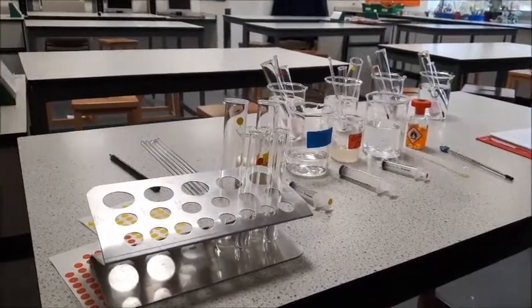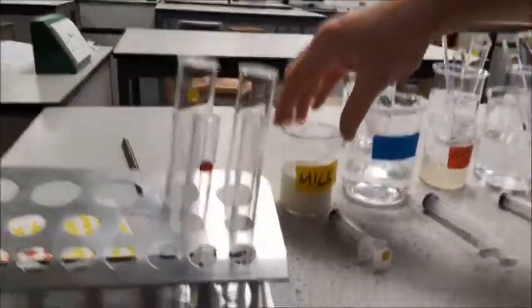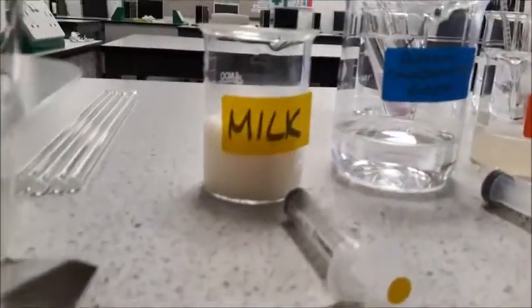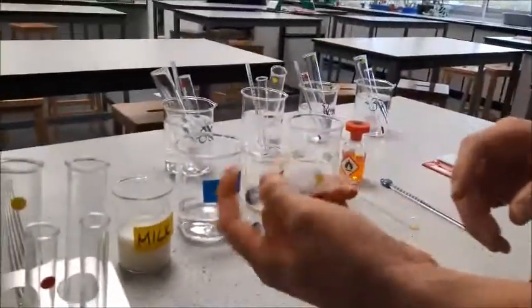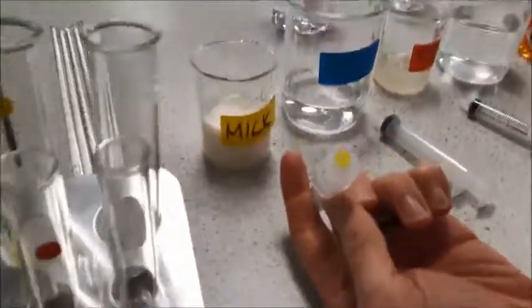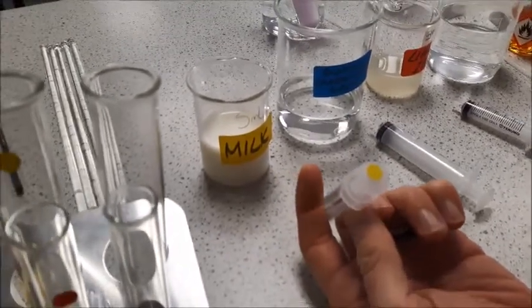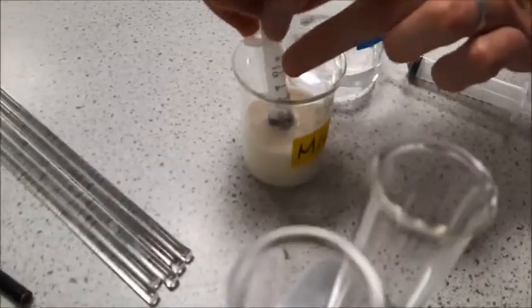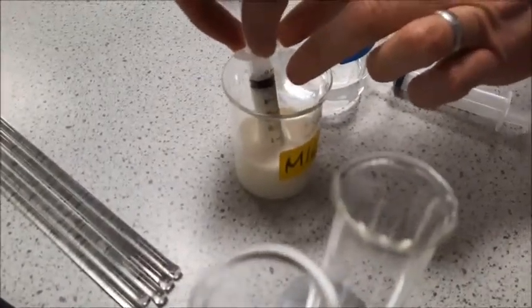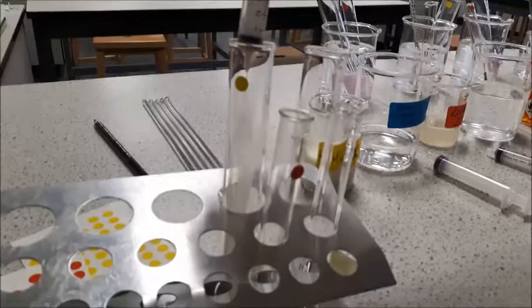The first thing we need to do is start measuring out some of our chemicals. I'm going to take 5cm cubed, or 5ml, of my milk using this syringe. We've colour-coded ours so we don't get contamination, but you can just as easily label up your beakers. So I'm going to take 5ml and add this into a colour-coded boiling tube.